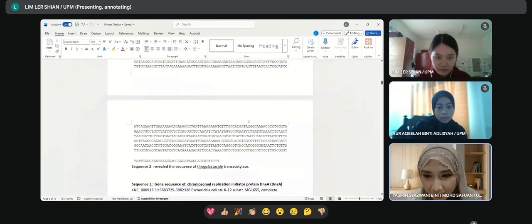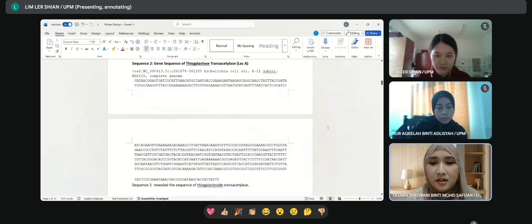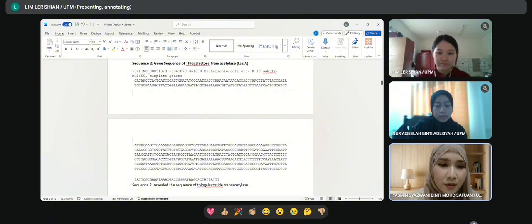Okay, so this is the sequence of lacA that we chose. Okay, so that's all from me.